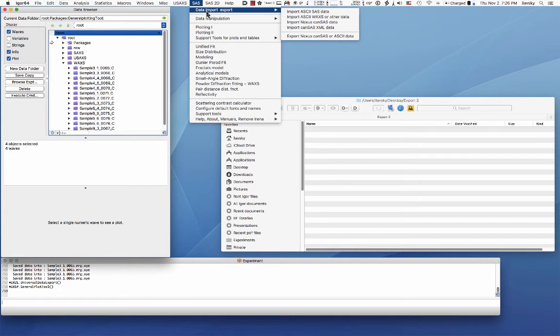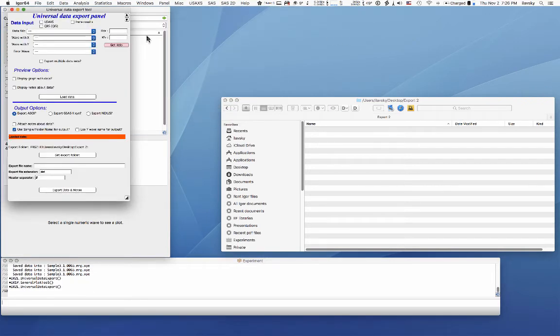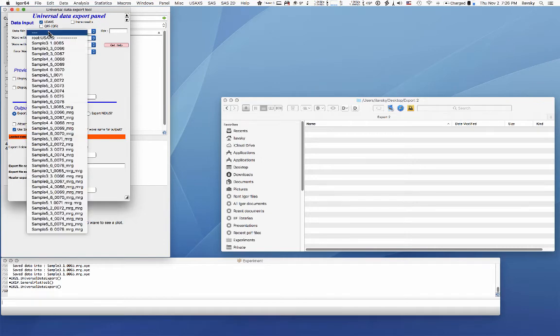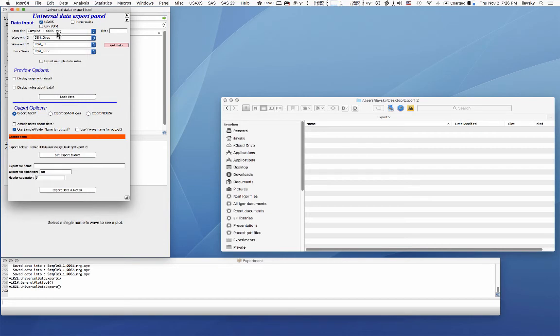You can then go in here and say, I want to export USAXS data. If that's what you want to do, you go in, pick for example, the USAXS data. It picks the data here. You can display notes and graphs.